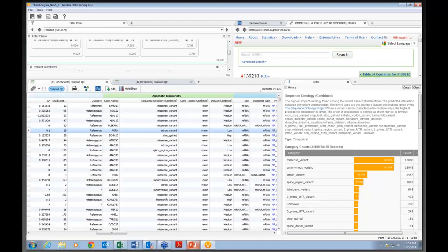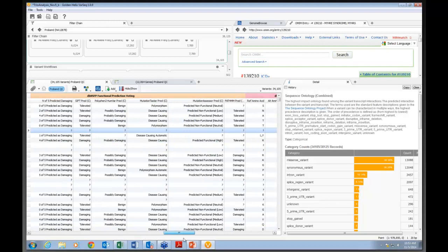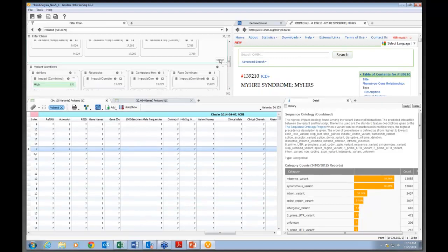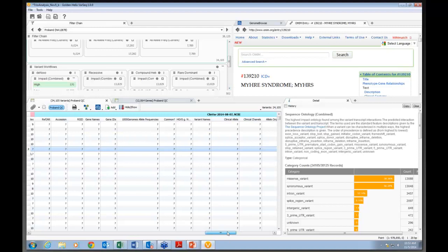I think we'll go ahead and just take one more question here, maybe 2 more before we wrap up. Can I use Varseq for diagnosis, like checking for known disease-causing variants? This, of course, is different than finding a new variant. The answer there is yes. We kind of saw an example of that here on the one workflow where I compared to ClinVar. And we could even look at it here again right now, just starting from this full list of 34,000.